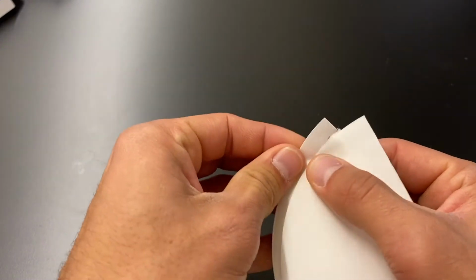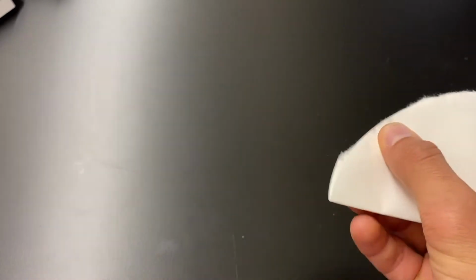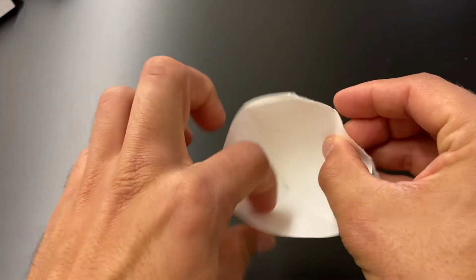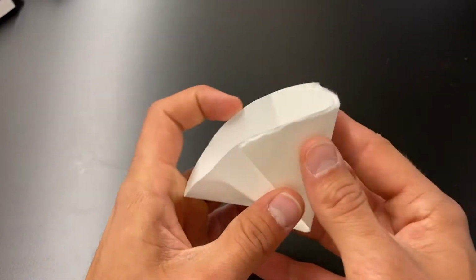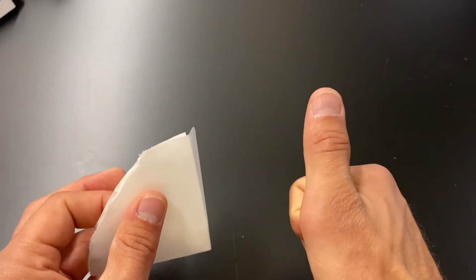The reason you fold this way and tear off the extra part is that it makes the cone a little bit wider and it fits the filter better, so you have more surface area of the paper touching the filter. Therefore, you just get a cleaner and faster and better filtration. Nice.